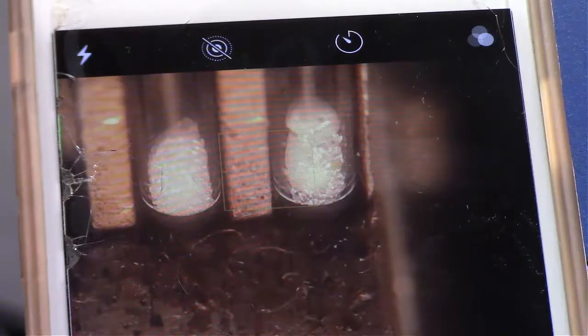Now for the sample on the right, it looks like things are about to start happening, but I don't see anything for sure yet. Okay, now it looks like we've got liquid forming. So those clear crystals, like I said, were definitely forming liquid. We started at 228 degrees Celsius. So at 228 degrees, that's when things started melting.